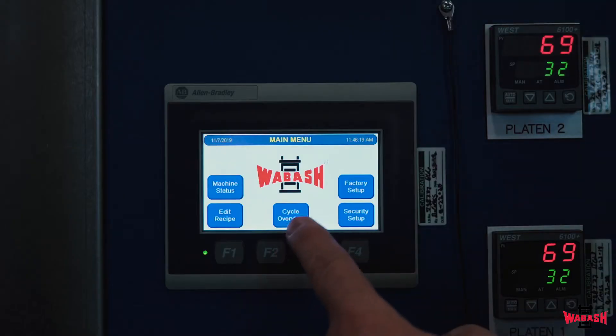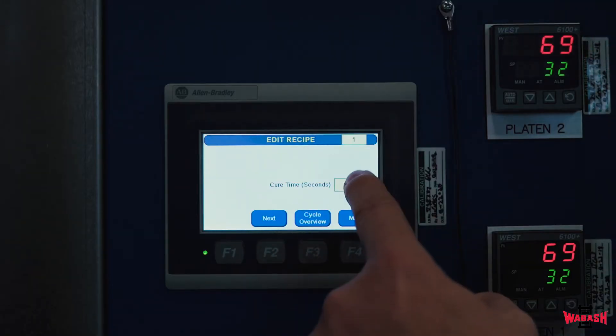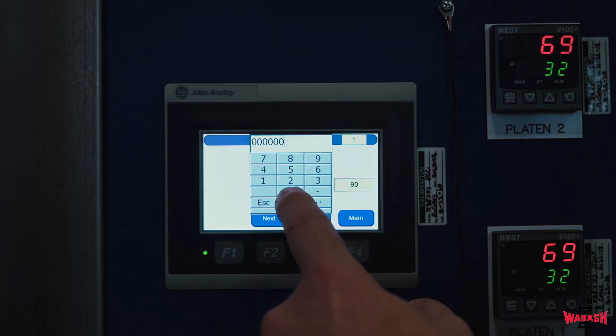All timing and counting functions are entered into the PLC by entering the run times in the recipe on the Allen Bradley color touch screen.